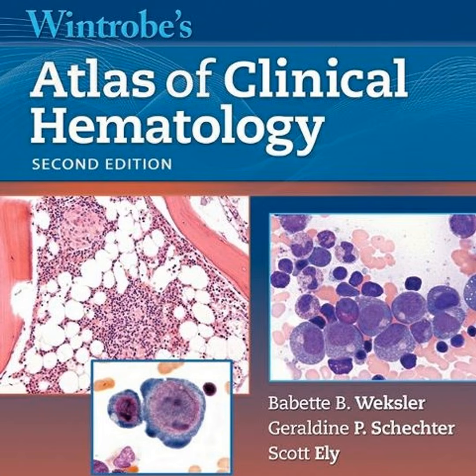We also use it for very specialized things, like diagnosing PNH, paroxysmal nocturnal hemoglobinuria, yes, by looking for GPI anchor deficiency using markers like FLAER and CD59. And in myeloma, or plasma cell neoplasms, we find the abnormal clone by its aberrant expression. For example, normal plasma cells should express CD19, while malignant myeloma cells often lose CD19 and pick up strange markers, like CD56.